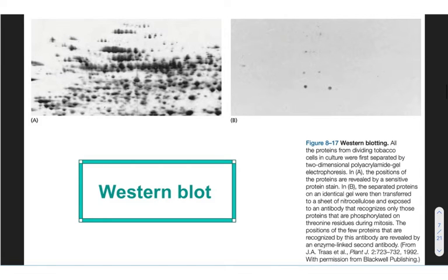Now, Western blot kind of has a funny story for how the name was made up. It's not from the West. There's another technique we'll cover later on called Southern blot, and this has to do with electrophoresing DNA. Now, there was actually a guy called Southern. That was his last name. And people in biology, when they started to electrophorese other things besides DNA, like RNA and protein, decided to run with the compass theme.